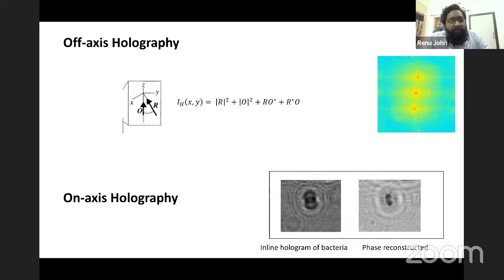Now we can actually enhance the power of the algorithm. With the advances in what we call regularizations or optimizations in holography, you can treat the hologram as a sparse object. Of course, a hologram itself is sparse by definition. Even if we have the two terms, the object and its conjugate, almost overlapping, you can use nonlinear optimization algorithms to deconvolve these two terms so that you can really get the object beam out.